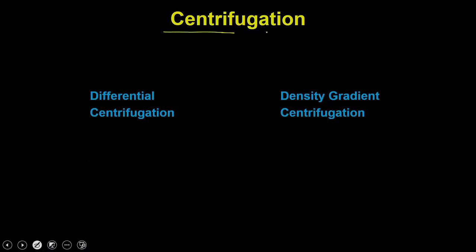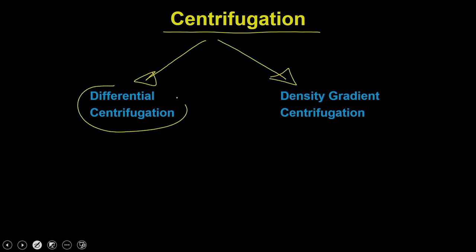As far as the centrifugation is concerned, it can be done in two ways. Either you can do differential centrifugation or density gradient centrifugation. The underlying principle of centrifugation remains the same, and I think you remember when we were talking about the maintenance as well as the operation of the centrifuge, we discussed the basic principle.